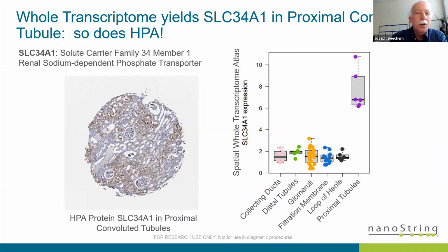I didn't really know what these whole transcriptomes would look like and how you can just follow the biology. Like I say, you recapitulate about 50 years of kidney physiology in one experiment, essentially. And then you can cross-validate it against the protein maps in HPA. I'm just amazed at that, because a lot of people say, well, how does the RNA correlate with the protein and all that?